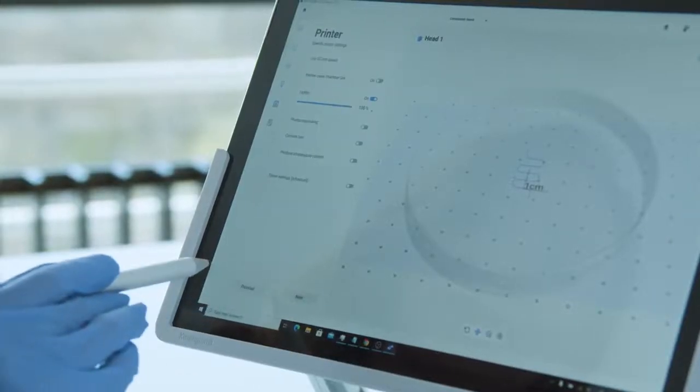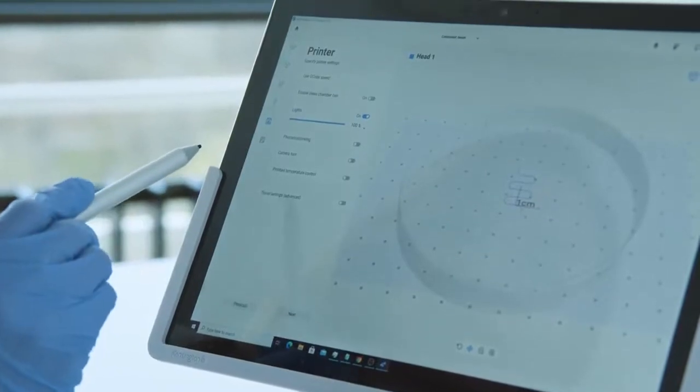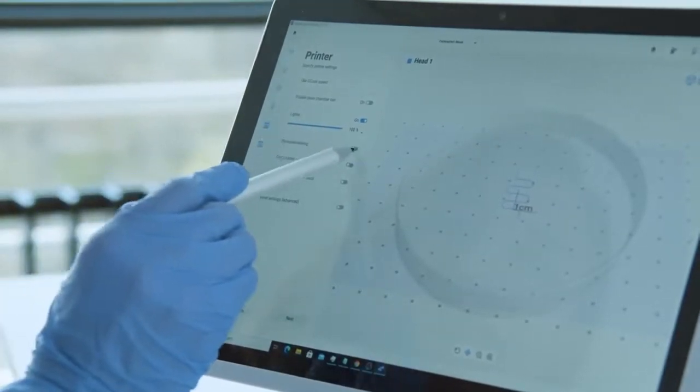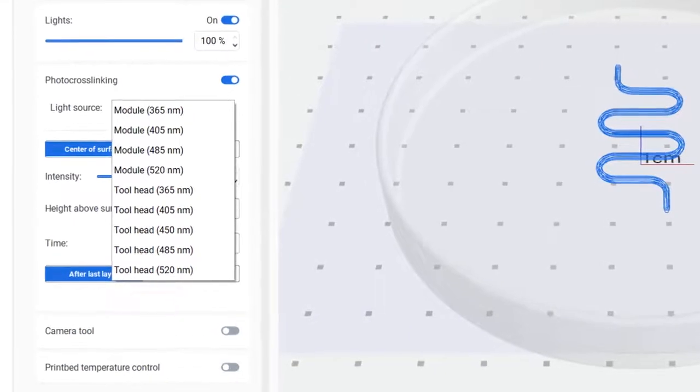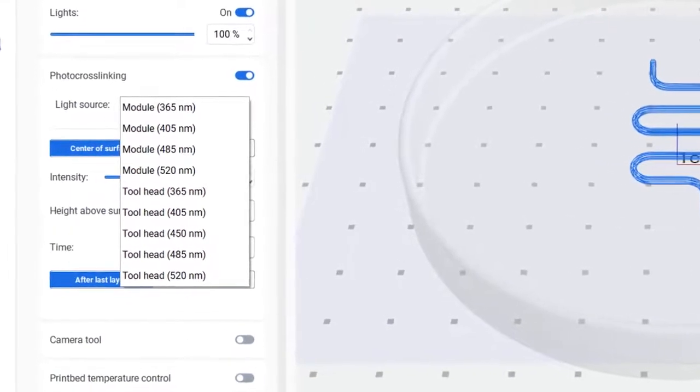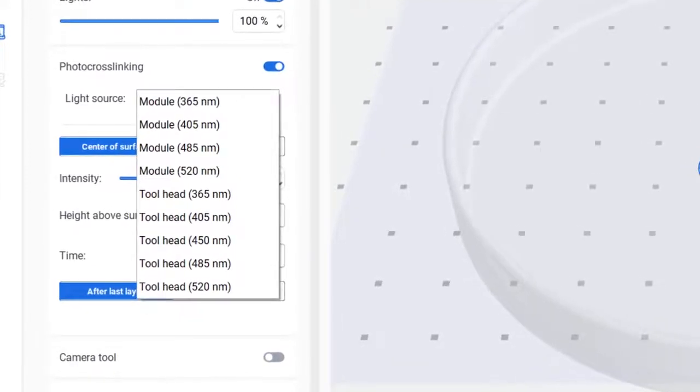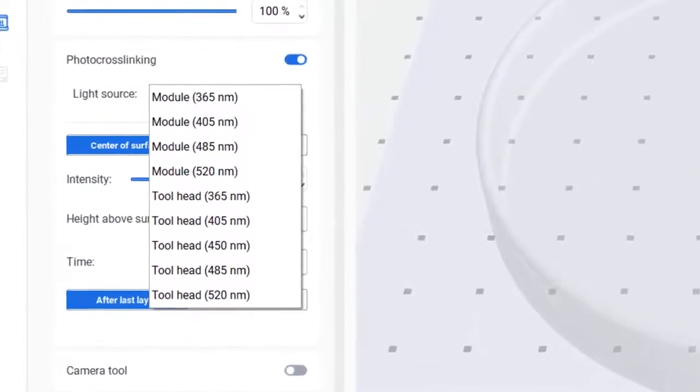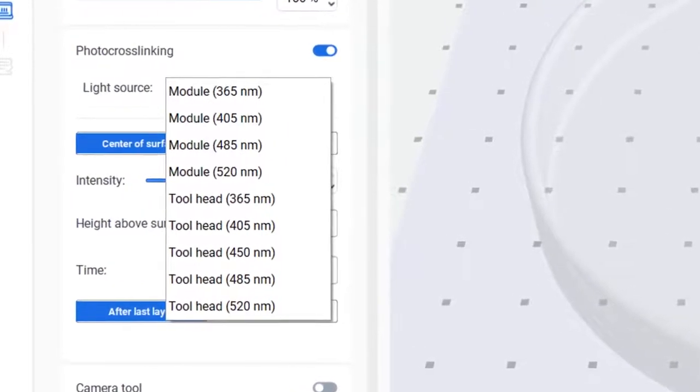If you are using photo-crosslinkable bioinks, I have good news for you. The Bio-X6 is equipped with four in-built photocuring modules and print tools to allow you to photo-crosslink by different wavelengths including 365, 405, 450, 485, and 520 nanometers.